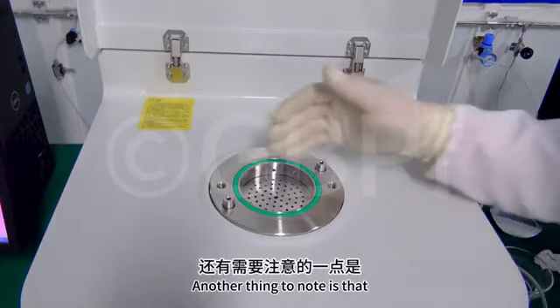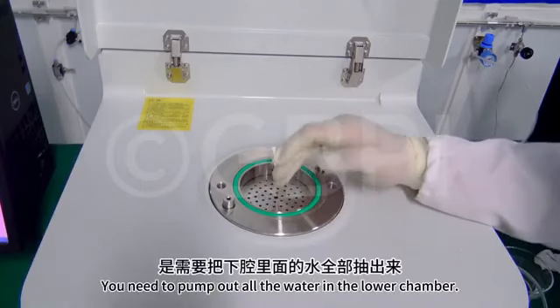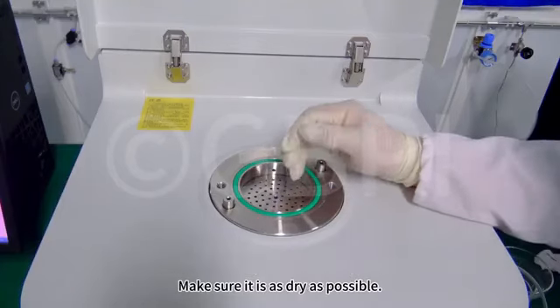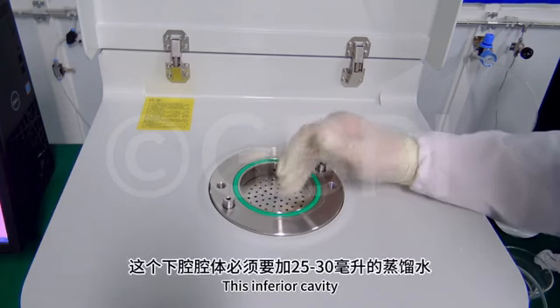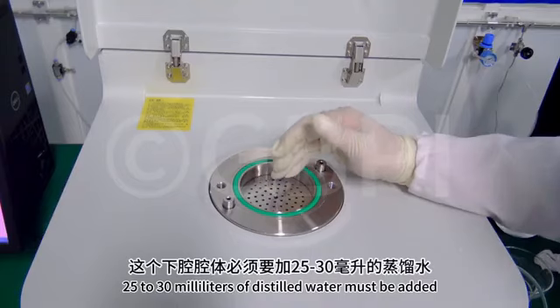Another thing to note is that when you finish the test, you need to pump out all the water in the lower chamber. Make sure it is as dry as possible. And then when we test the samples, 25 to 30 milliliters of distilled water must be added to this lower chamber.